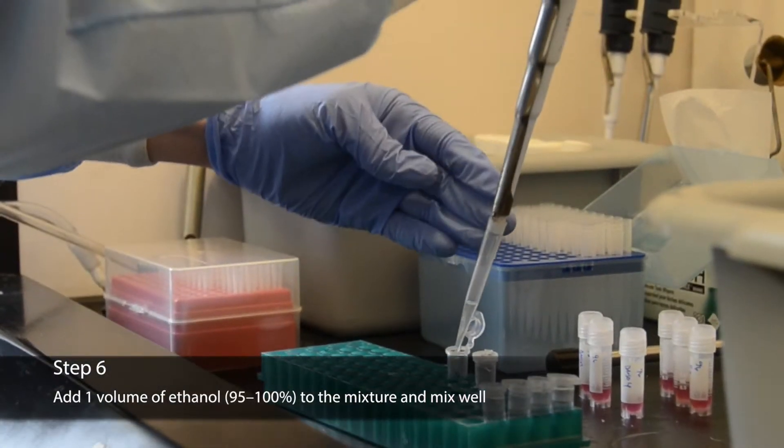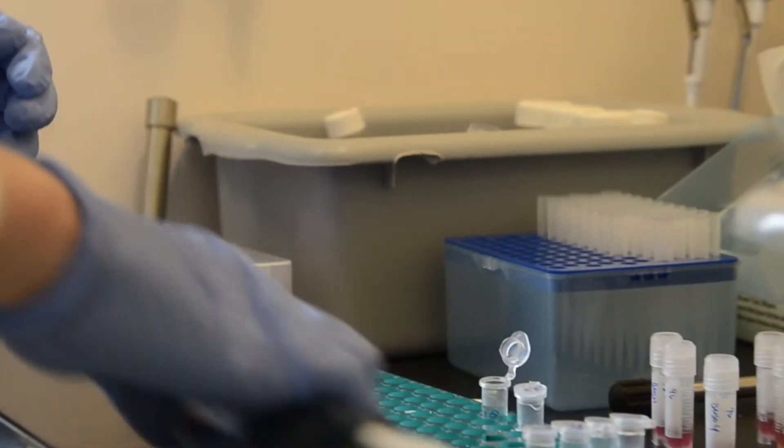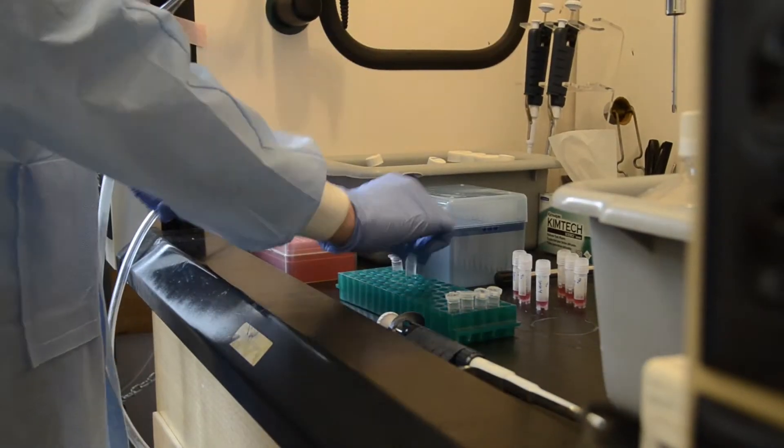Next, add one volume of 95 or 100% ethanol to the mixture from step 5 and mix well. Once again, do not vortex.